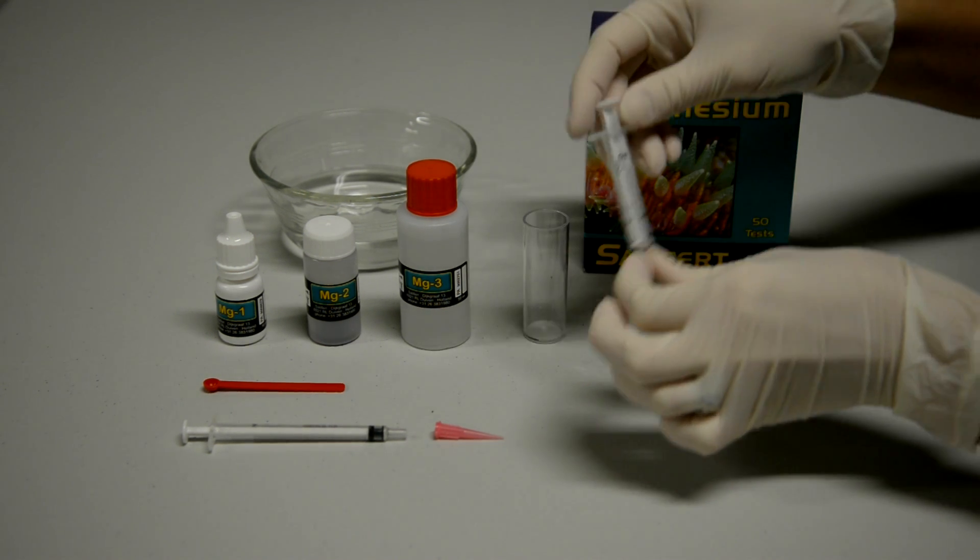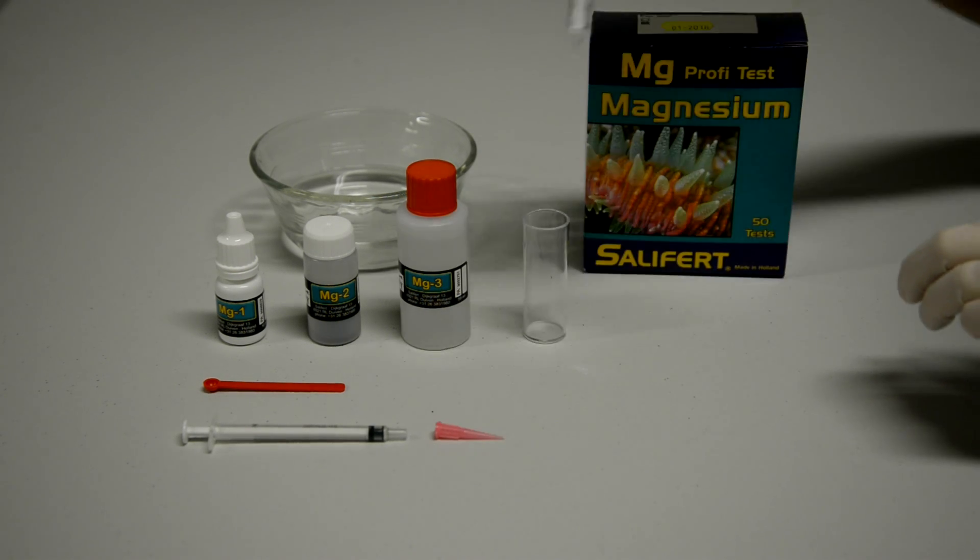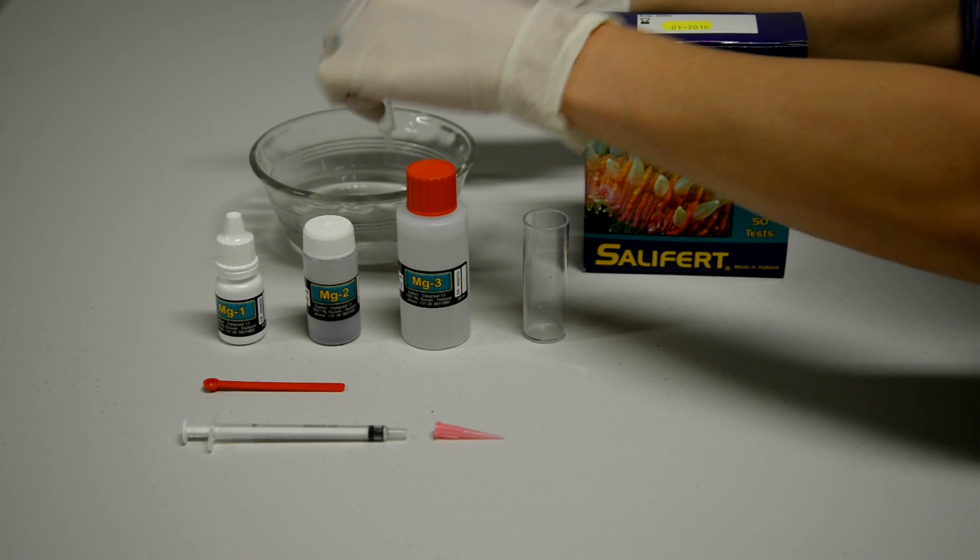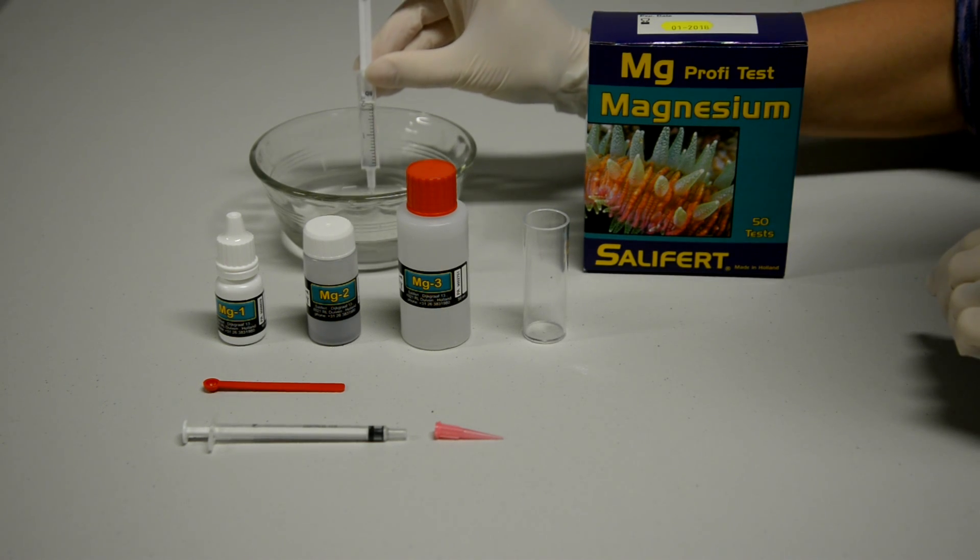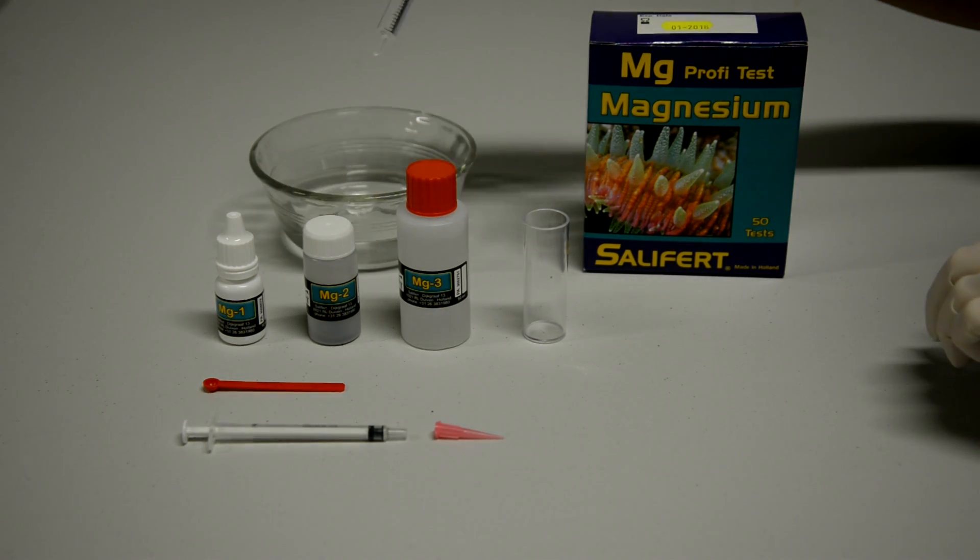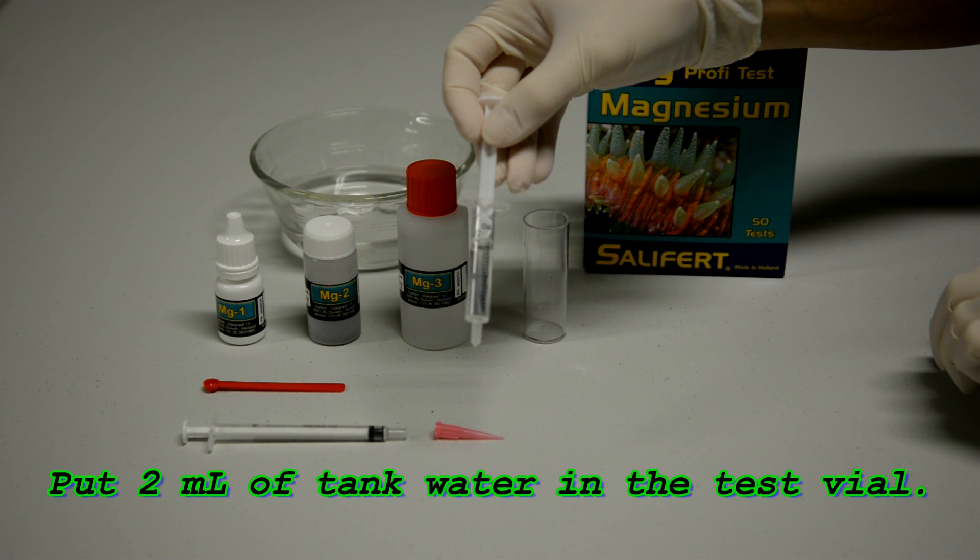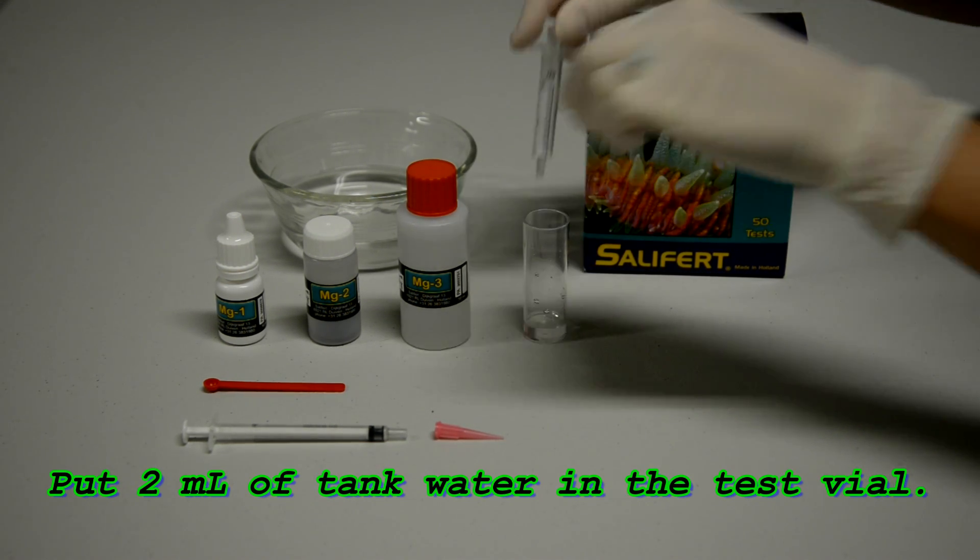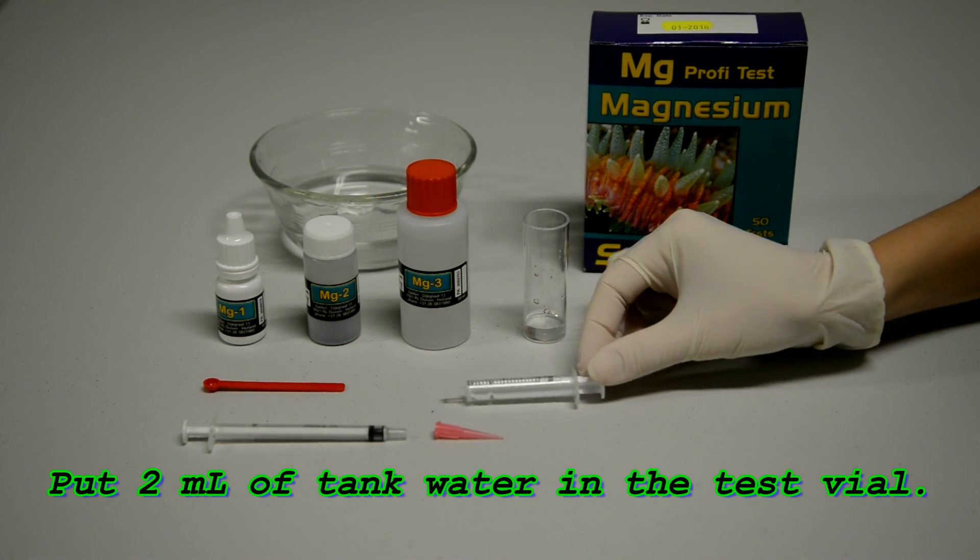So you're going to start with the bigger syringe, take a sample of your water from your tank, you're going to put that into the test vial. That's actually 2 ml of your tank water. You want to make sure that the syringe plunger is at the 2 ml line, don't worry about the bubble.